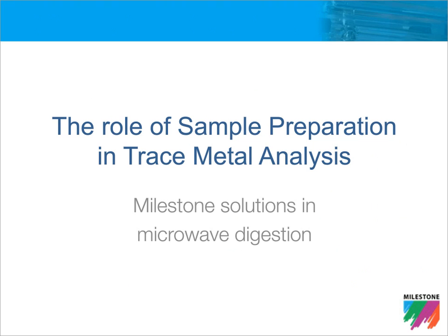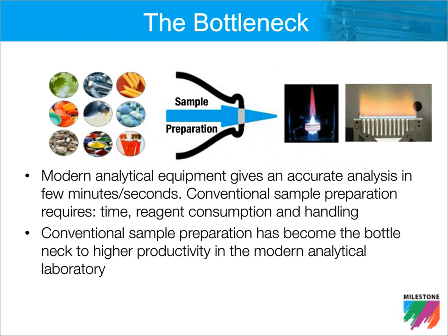Okay, so we're going to switch gears slightly here and talk about the critical role of sample preparation in trace metals analysis. If you recall from the previous slide that Dr. Nobrega showed, most errors during trace metals analysis are introduced during this key step. With the analytical instruments of today, we can get results in a matter of minutes, sometimes seconds. So conventional sample preparation techniques are really the bottleneck in the whole trace metals analysis approach.